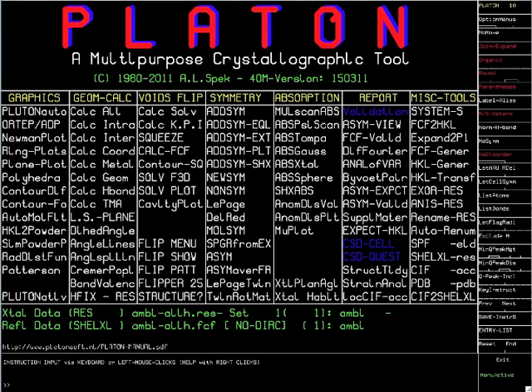Hi, my name is Rob Hooft. In this short video I will show you how to determine the absolute configuration of a refined x-ray structure using our Bayesian method. The video will be based on the implementation in Platon.